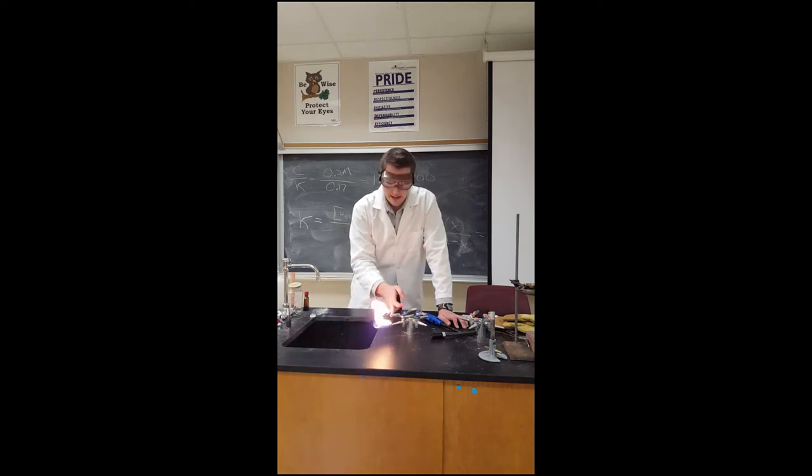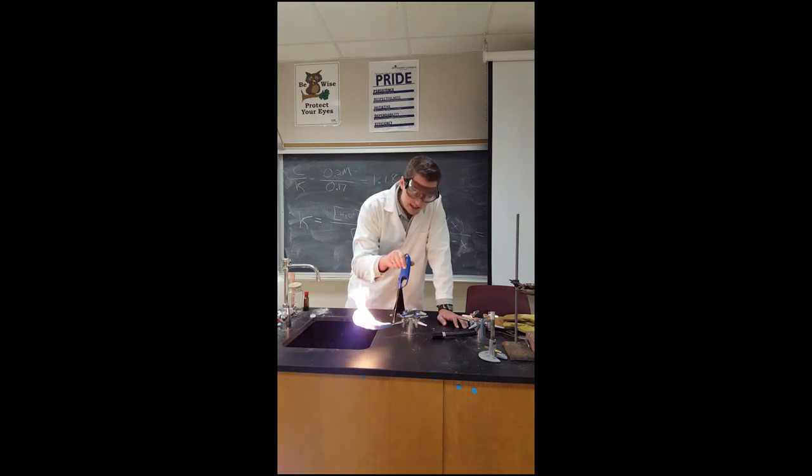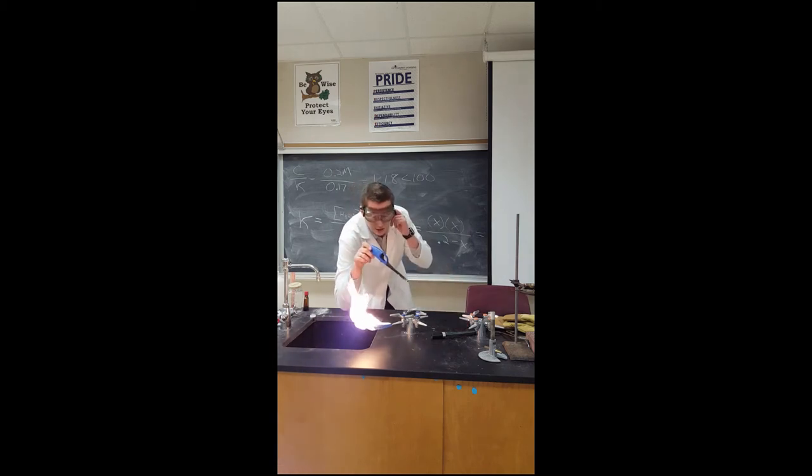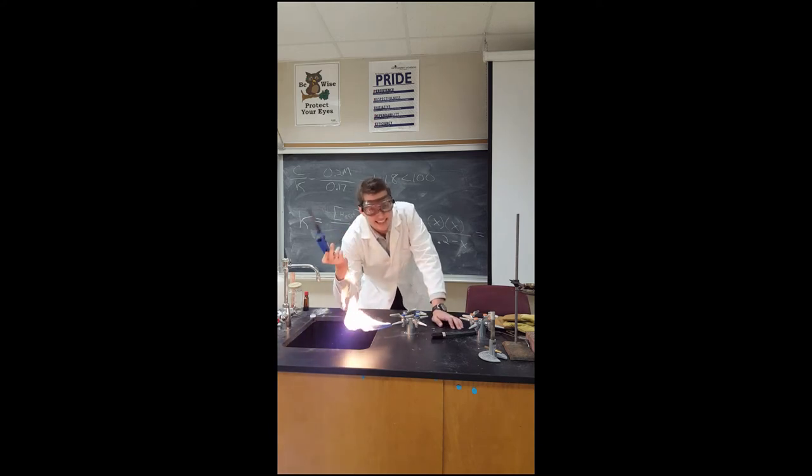You might ask yourself: why is this flame not going back into the pipes and blowing up the school? Well, not really, because this is made of metal so it's not going to melt easily. A couple of reasons why it won't go back in and explode: one is there's not really any oxygen in the pipes — the gas needs to get out and mix with oxygen in order to combust, it's a combustion reaction. Also, out here it's very low pressure compared to inside the pipes, which is high pressure. Things move from high pressure to low pressure, so it won't want to go back in. And we also have one-way valves that only let things go in one direction.